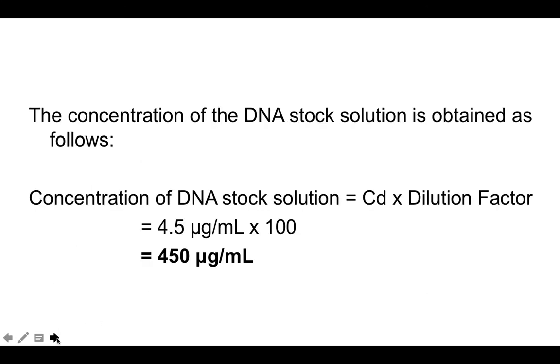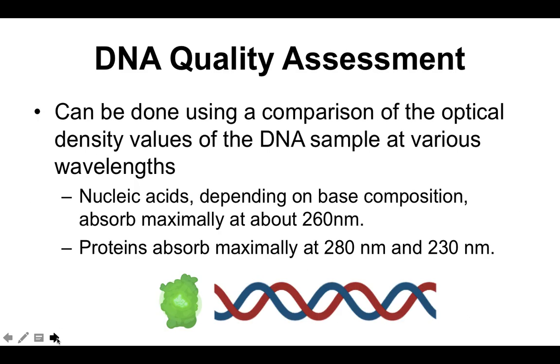So you just have to multiply the dilution factor to your determined concentration of your diluted DNA so that you can get the concentration of DNA in your stock solution. Okay? Right. So now let's proceed to the next slide.